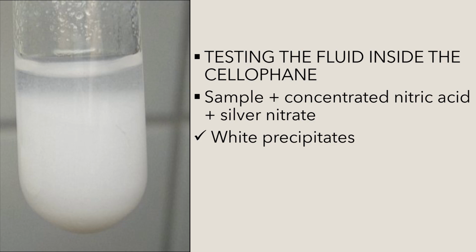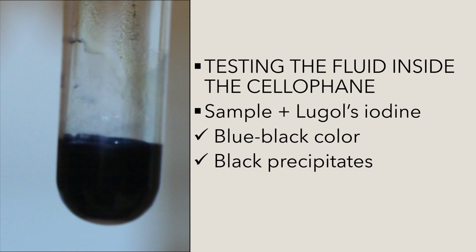Okay. And then after that, we tested also for the presence of starch with the use of Lugol's iodine. In the procedure, we placed 1 ml of fluid from the cellophane, and then after that we added drops of Lugol's iodine. And again, the fluid inside the cellophane should give a positive result for this one because the starch solution will remain inside the cellophane. It cannot cross the semi-permeable membrane.